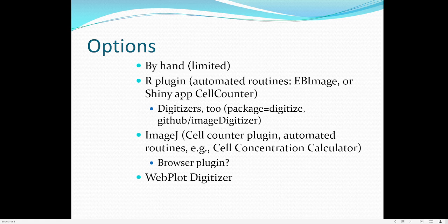Another aspect of cell counting is to combine the hand approach with an option to digitize, where you extract image information from your pictures and then save that. R has a number of these packages ranging from the simple to the more challenging to use. And then what I'm going to show you though is this one right here.